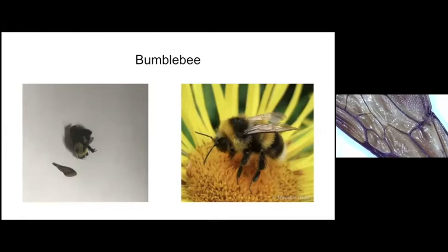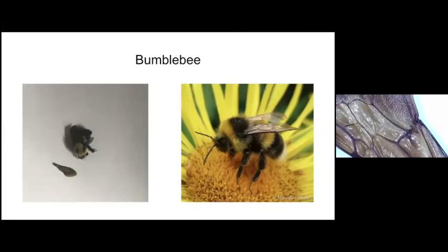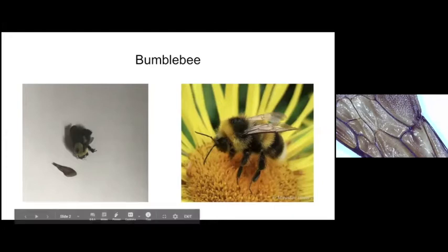No. What about dispersing pollen? Is that helpful? The bee can fly? Okay. Well, you guys did really good here. You want me to show you another one?